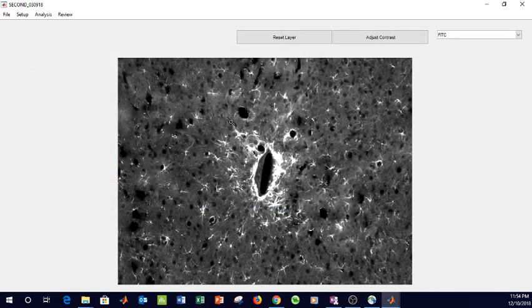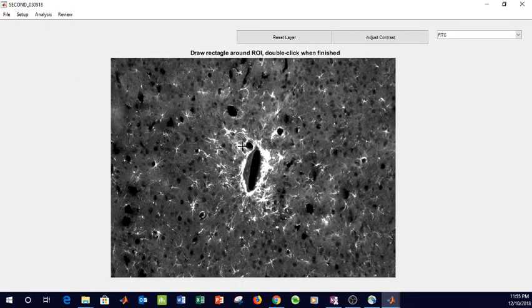And we want to annotate this image. We want to tell the software where the boundary of this hole is. At one point we had an automatic way of determining that. You basically point to this area and the program finds the dark area and automatically determines the boundaries. But we figured out that it worked half the time and half the time it didn't, and by the time we messed around with debugging and figuring out the errors, it was faster to just do it manually anyways.